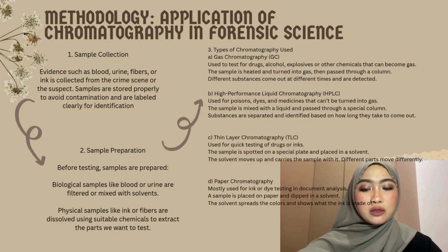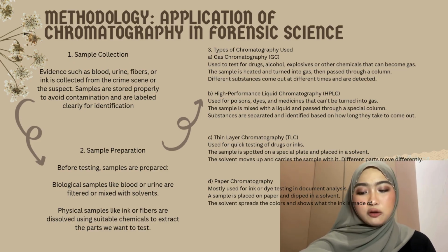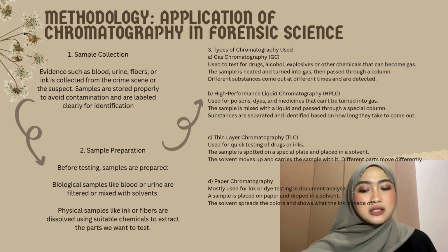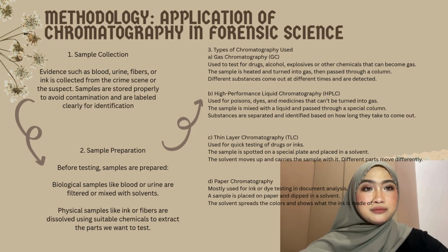First, gas chromatography, GC. Gas chromatography is used for substances that can become a gas, such as drugs, alcohols, and explosives. The sample is turned into gas and passed through a column. Each substance comes out at a different time, helping us identify what is in the mixture.